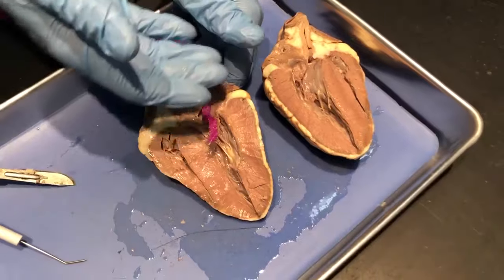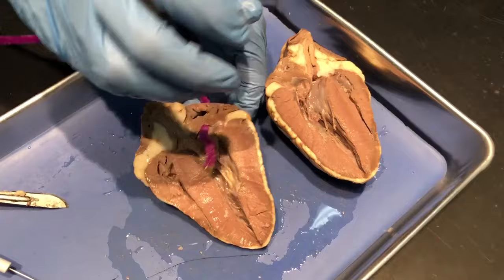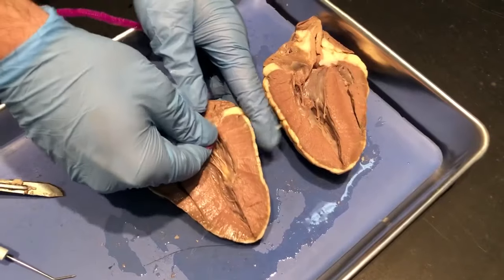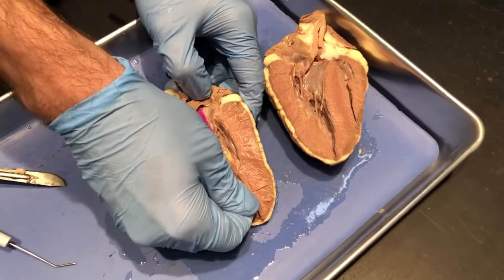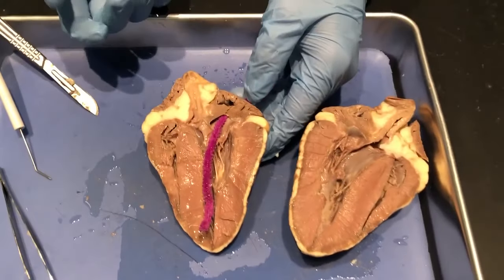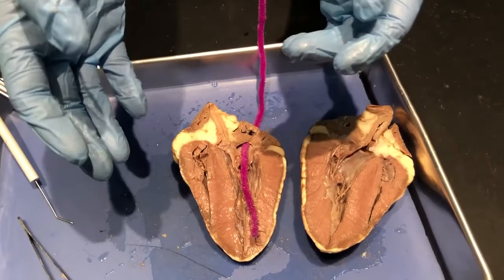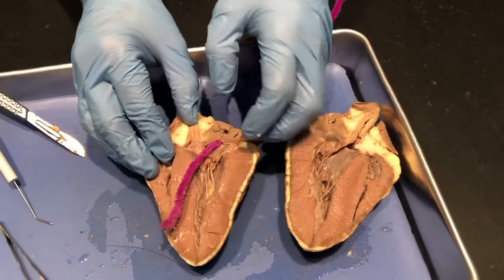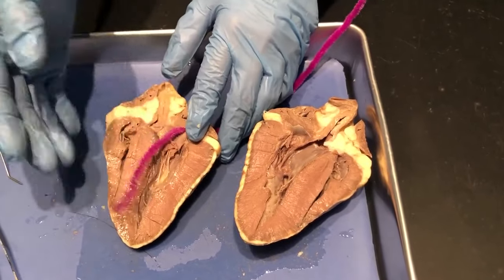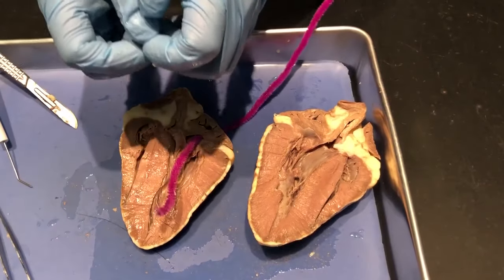Blood will pool up in the atrium as it moves from the body into the heart. When it gets heavy and full enough, this little trap-door-looking thing right here — this heart valve — will release and cause the blood to flow down into this larger chamber, which is called the ventricle. You can actually hear the atrium and the ventricle beat individually. When you hear a heartbeat — lub-dub, lub-dub — the lub is the atrium contracting, and the heavier dub is the ventricle, which makes sense because the ventricle is much larger and has much more muscle around it.